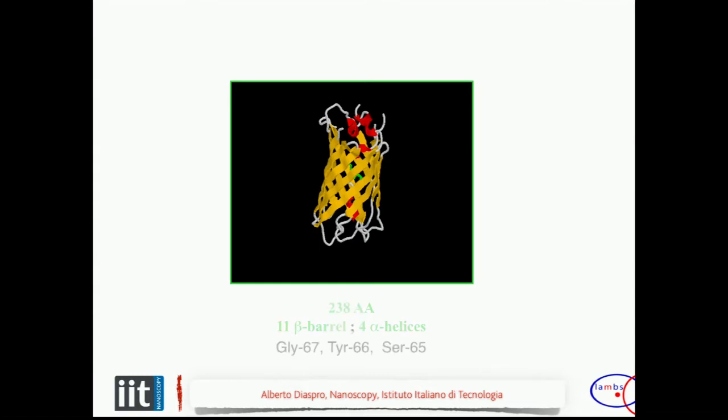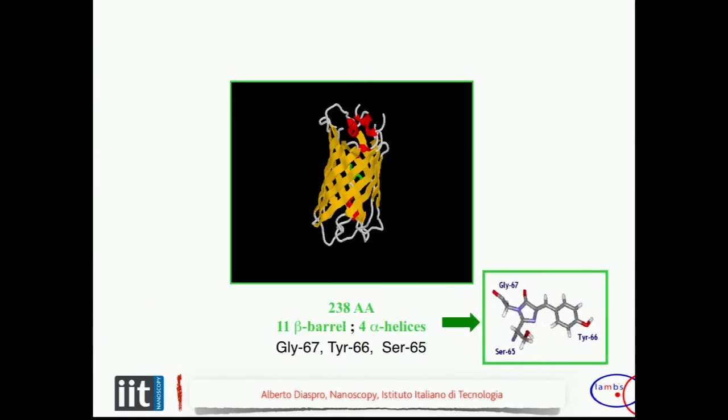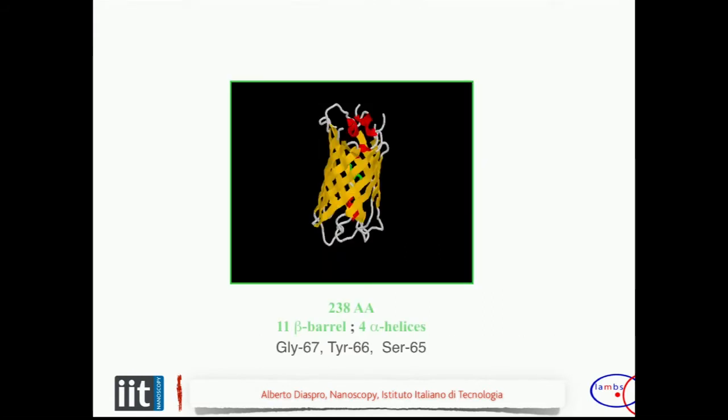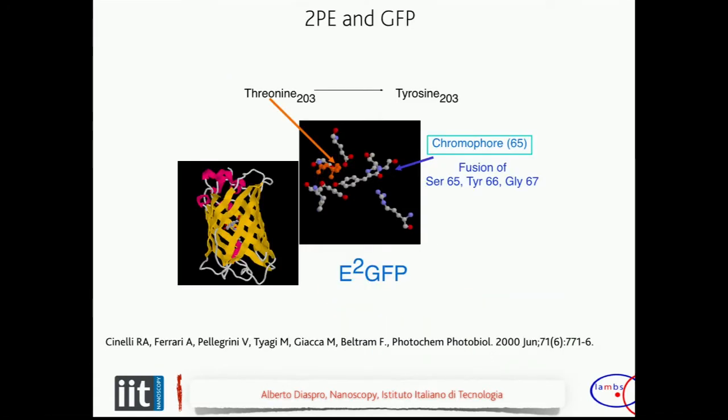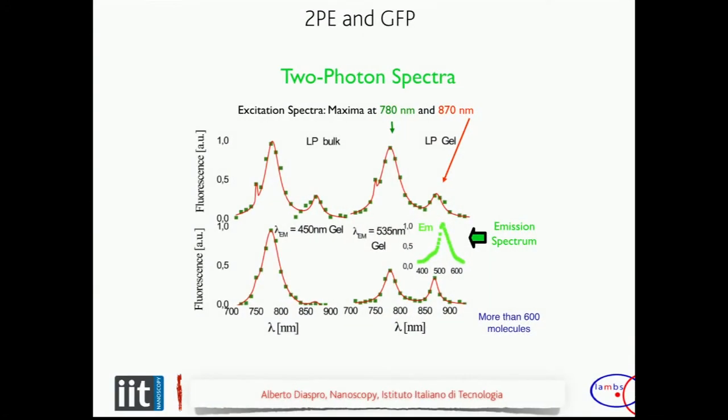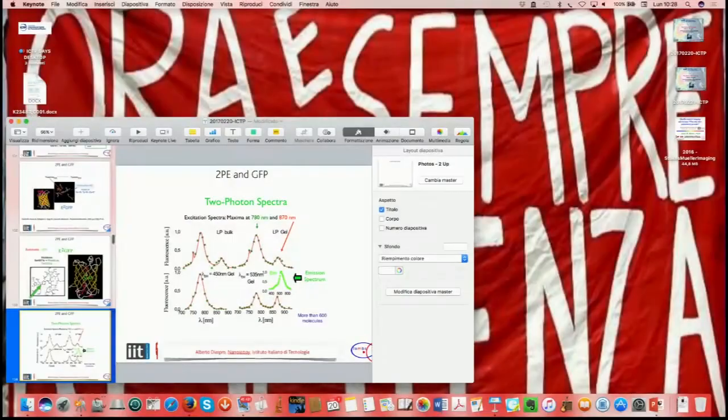This was, okay, this is the green fluorescent protein. And this was a variant of this molecule. The person introducing this was Mauro Giacca. This molecule has a mutation here. And what is relevant, I will be back in case on this tomorrow. Not sure, but I will.